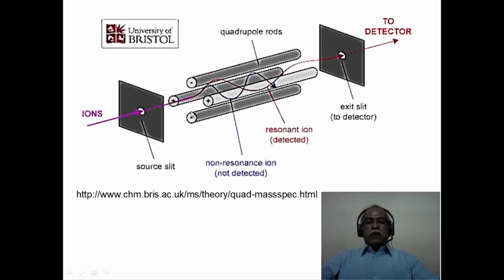For example, a positively charged ion will come closer to the negatively charged electrode, but by the time it approaches the negatively charged electrode, it will be charged positive because the alternating radio frequency will alternate the charges along the electrode, so it will get repelled, then come closer to, let us say, another negatively charged electrode. By the time it comes close here, it will be positively charged. In other words, the potential will change essentially, and in the process it will take a helical pathway.